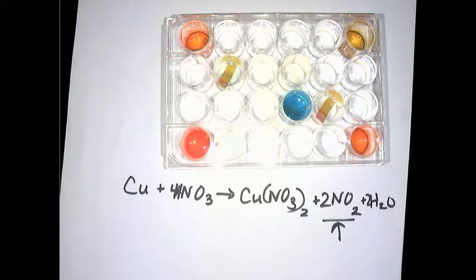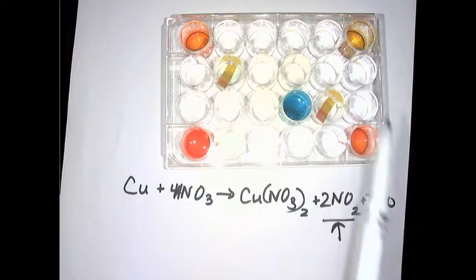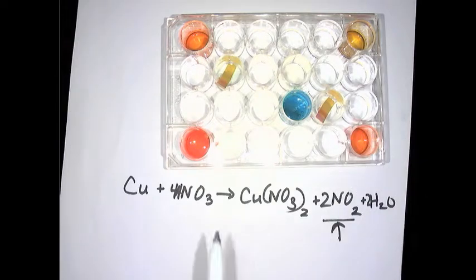So this is our well plates after about 5 more minutes of reaction time. And you can see that now the outer wells, we've got like a really bright red, a yellow, and an orange. So over a longer period of time, you can see that the acid really begins to start to mix with the air and the water. Had we left the bag shut for a longer time, we would have seen an even larger change in pH for the water wells as well.